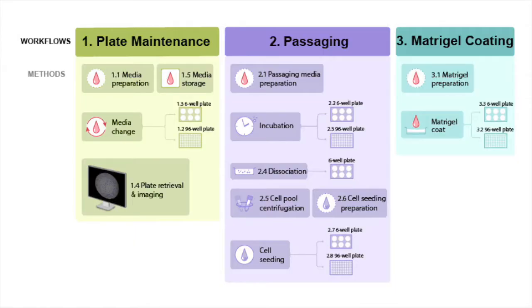Our system contains three main workflows: one, plate maintenance; two, passaging; and three, matrigel coating, each with a unique and customizable set of methods. All these workflows will be shown today.